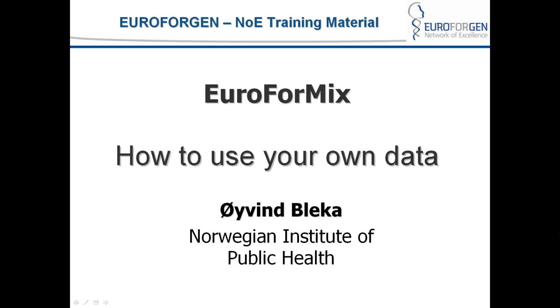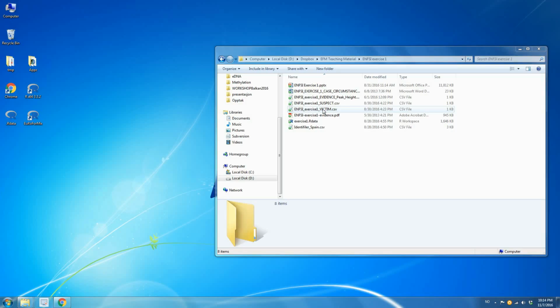So in this session, I will show you how to use your own data for EuroForMix. I will first show you how to import your own allele frequency files, your own stain sample files, your own reference samples, and also show you which files EuroForMix uses for getting kit information. So this is the dataset I want to use in EuroForMix.